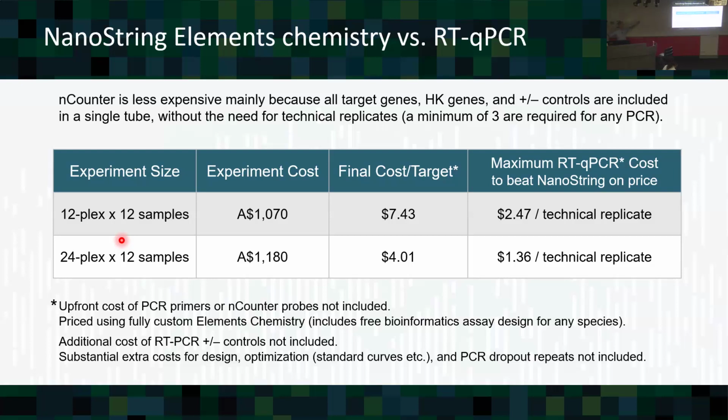Now with the big panel products, you're looking at thousands of dollars an assay, and maybe you're crossing $8,000 to $10,000 sometimes. Maybe it's not that much, but anyway, it's a significant amount. But again, when you look at it from a value point of view, a lot of people use it because if they've got difficult samples, maybe samples that have failed by sequencing, they will run with the nCounter. And often people come across because they've got some intractable problem, the samples don't work or whatever, or there's not enough of it. They can't split it many ways, so they keep it all together, put it into one tube, and the nanoString pops it out.